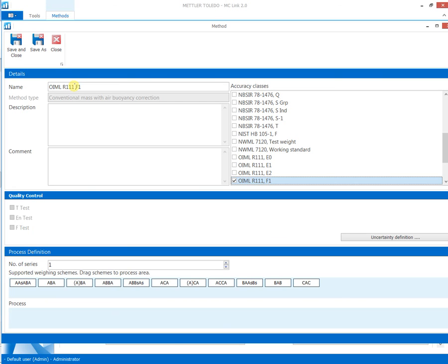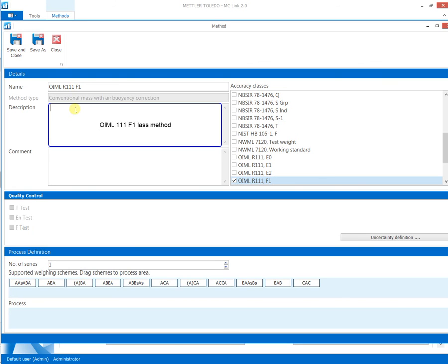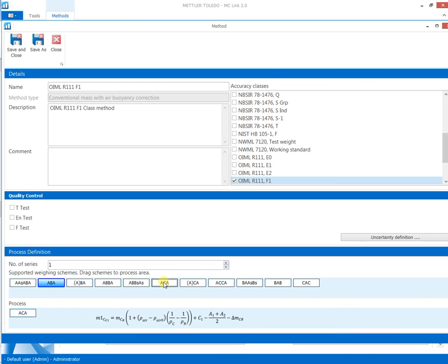The weighing schemes are added or removed to the process by selection. All relevant calibration formulas are defined in the background.